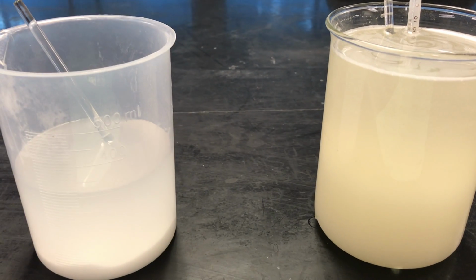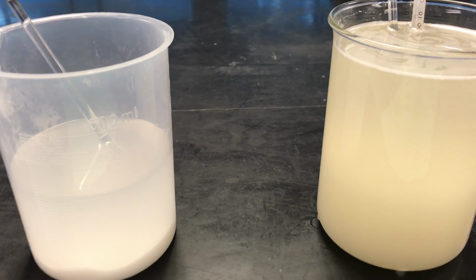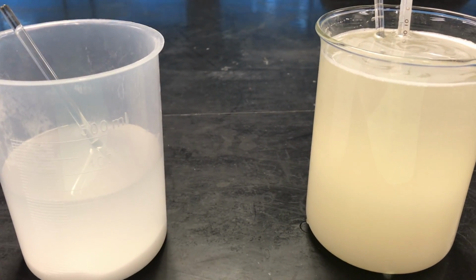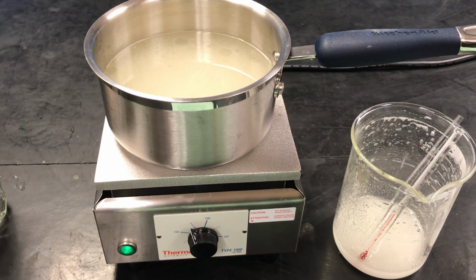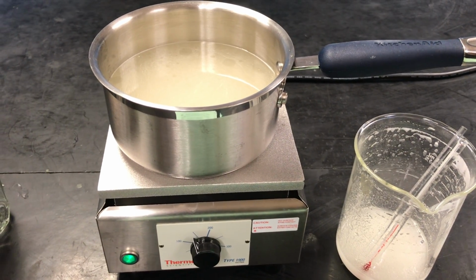We're going to continue adding solute. I'm going to choose the sugar again because I want to make something delicious, but I'll also do the borax. We want to make a super saturated solution out of these next. So moving on in the procedure, I chose to move on first with the sugar, and I can tell you my hands are already pretty sticky.